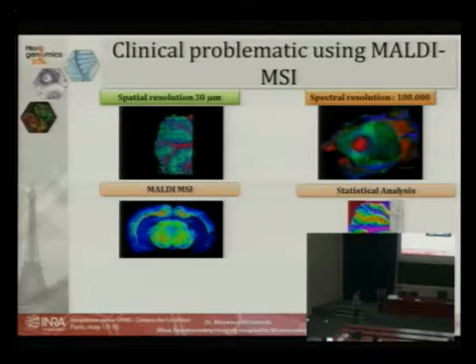And you can also use a lot of software to analyze your molecules. And in this picture, you, for example, have a molecular histology image obtained not on the morphology of the cells, or the shape of the cells, but only by the molecular content of the cells.